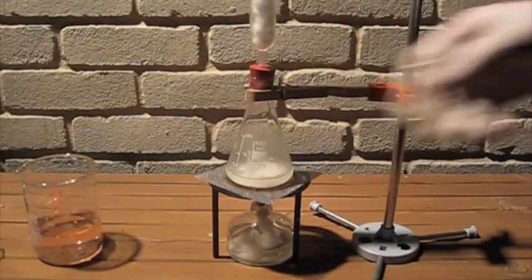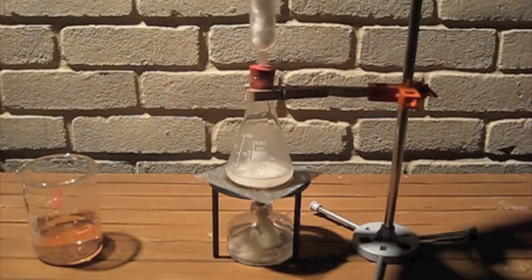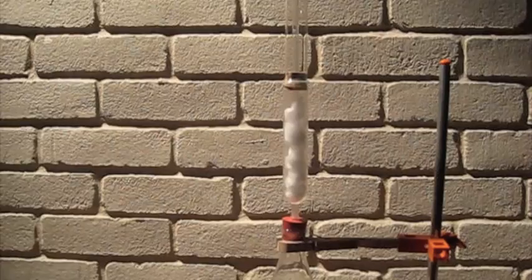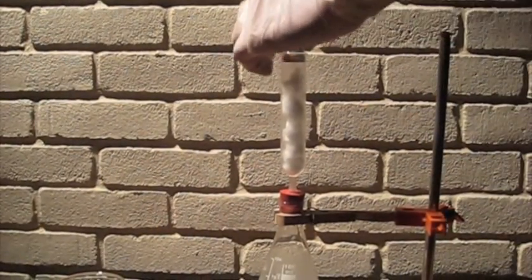To the flask I'm adding a test tube that came in my kit with some cotton wool in it and another test tube on top with a glass rod which extends into it. The ammonia will come from that glass rod.